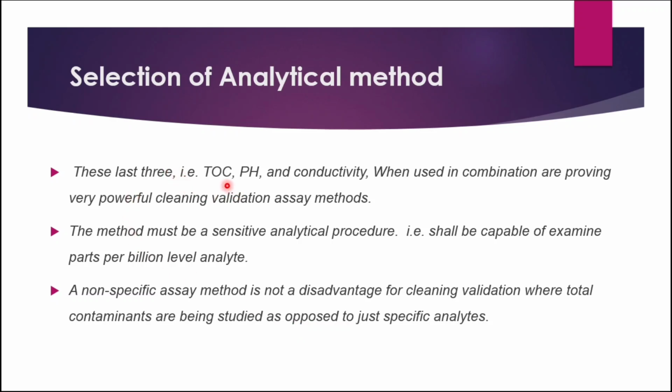These last three methods, that is TOC, pH and conductivity, when used in combination, are proving a very powerful cleaning validation assay method. So these three methods are recommended when used in a combination. The method must be sensitive. Analytical procedure shall be capable of examining parts per billion level of analyte. A non-specific assay method is not a disadvantage for cleaning validation where total contaminants are being studied as opposed to just a specific analyte. So wherever it is tested as opposed to the specific analyte, you can use other methods as well.